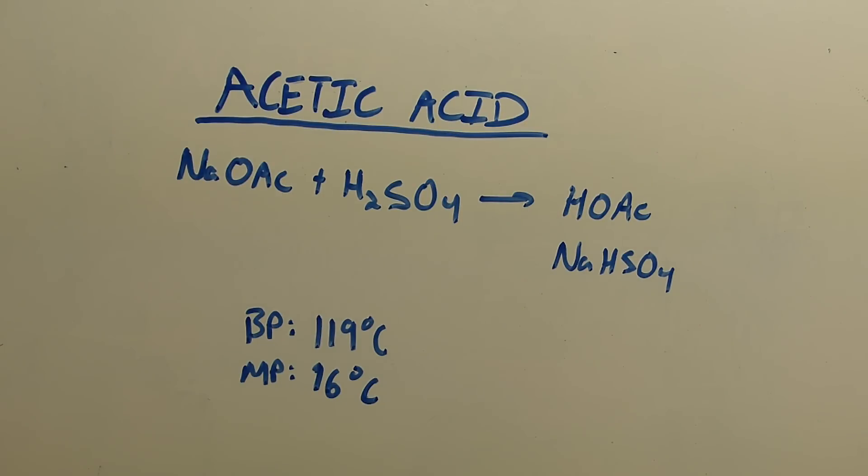There's a couple things you need to watch out for when you're running this reaction, and I'll get into that a little bit later. The reason I say here that we're not making glacial acetic acid, as I've seen in a lot of other YouTube videos, is that the acetic acid that comes off is not quite anhydrous and free of water, since the sulfuric acid I'm using is approximately 93%, and the sodium acetate, while fairly anhydrous, isn't completely dehydrated.